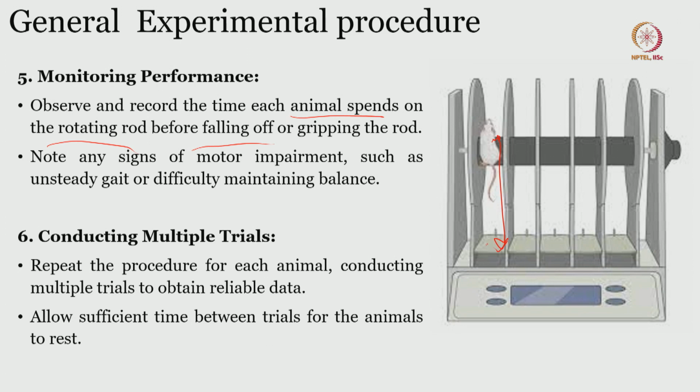You need to make sure that you notice any sort of motor impairment, in terms of unsteady gait or difficulty maintaining balance. All this can be noticed while the rod rotates.